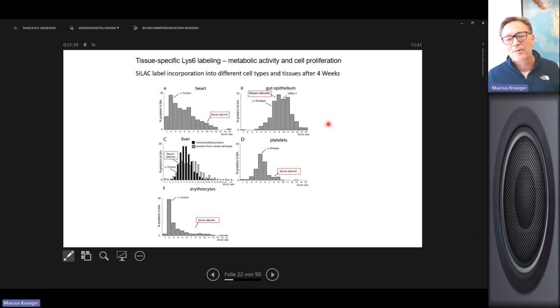And of course, for the SILAC mouse, this is true. We always have to look for the pairs in the light control versus the heavy spike-in, and versus the experimental and heavy spike-in. We always should find 2 pairs, right? If we don't find them, we usually don't use them. So overall, indeed, we get fewer identifications compared to a label-free protein quantification. This is kind of a disadvantage, if you like. However, those proteins which you quantify are quite accurately and robustly identified.